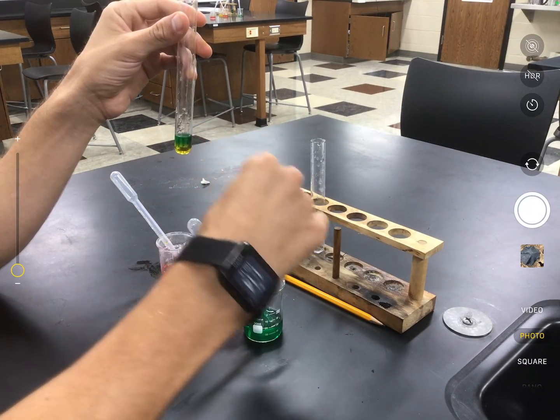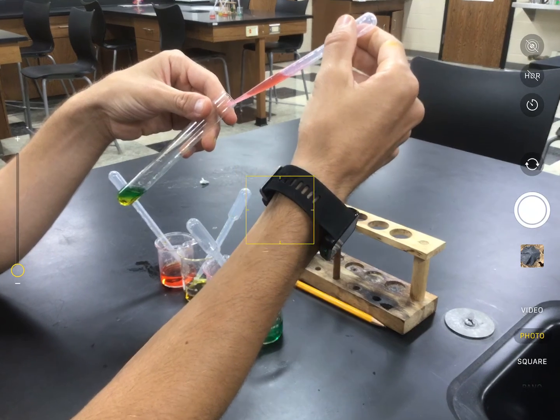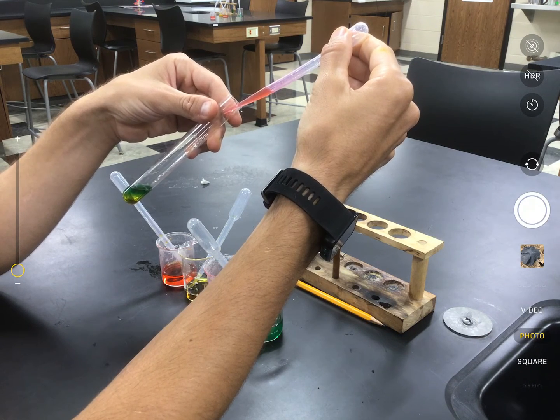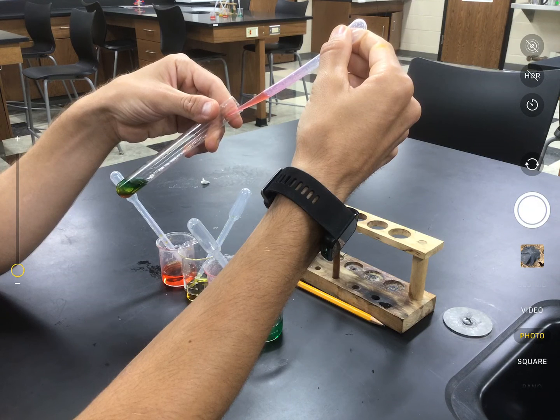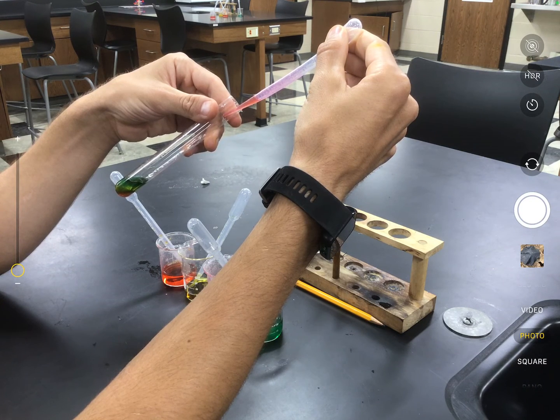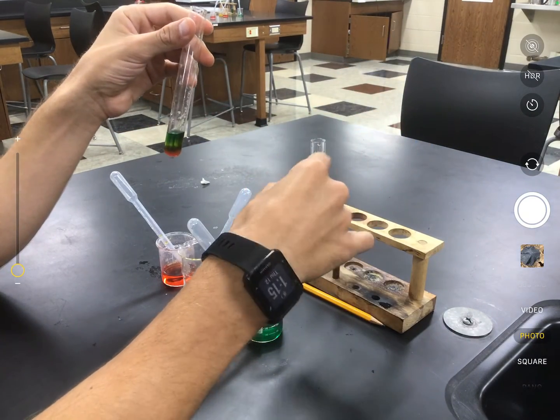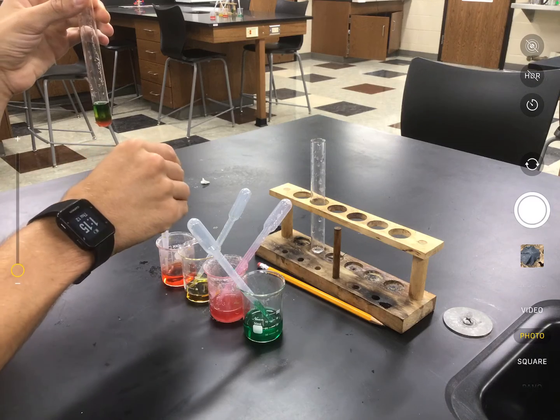So now I'm going to do red. Okay, so now we've got a red layer, a yellow layer, and then we got a green layer on top. So the next thing I'm going to do is our final color is orange, so I'm going to pour that one in.